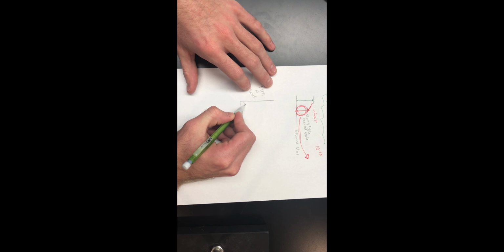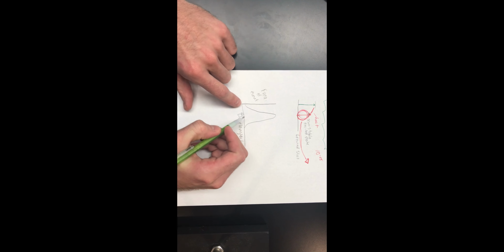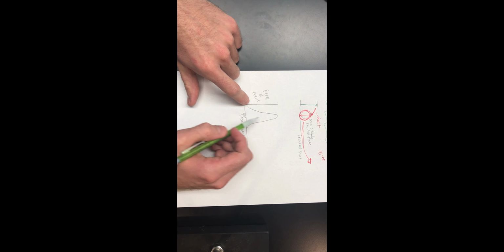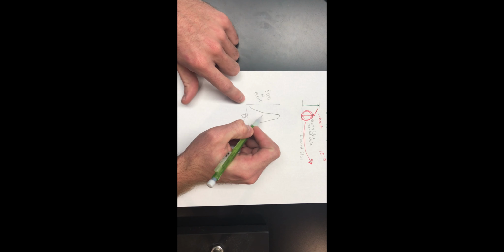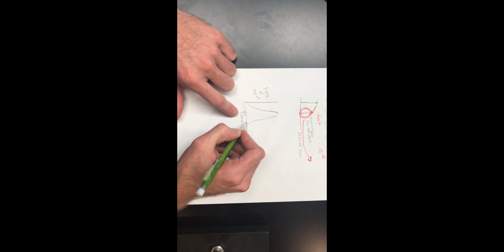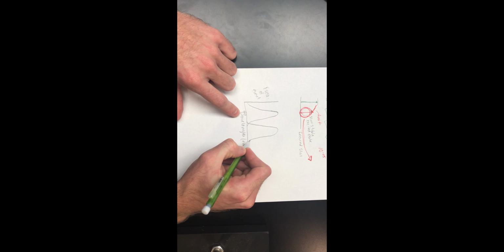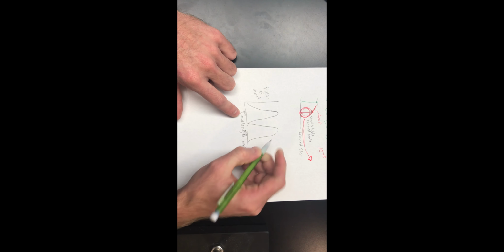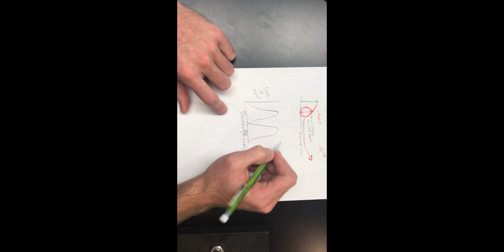When I say it can be excited at other wavelengths, take into account these other wavelengths that can also excite it. But this is where we're going to get the most emission, when we excite at this wavelength of 620. Then the emitted light is going to be around 680 nanometers. This is the optimal emitted light peak.